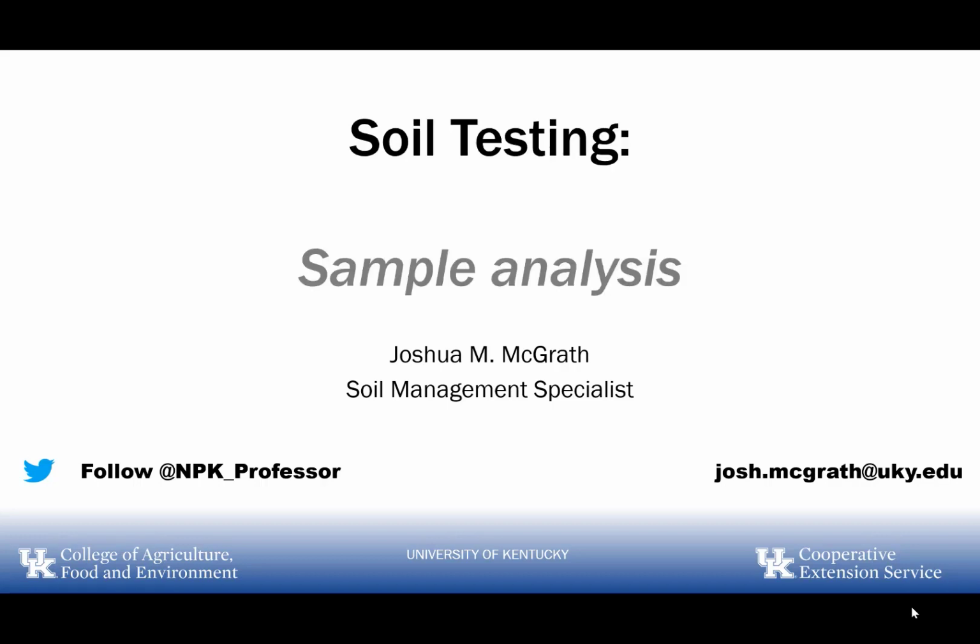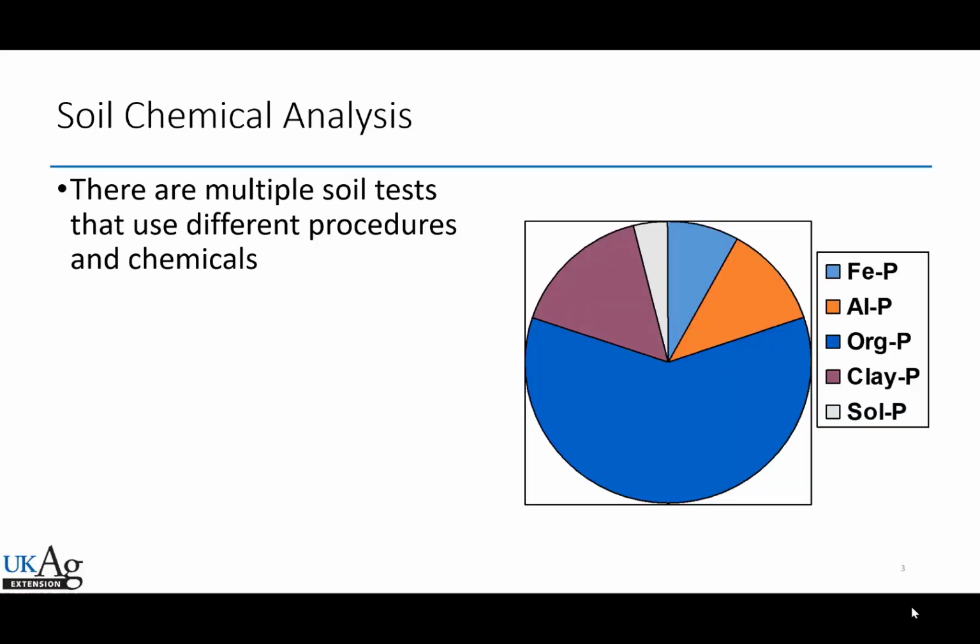In this episode, we're going to be talking about soil testing and specifically analysis of those samples you can collect. So when we take and send off a soil sample for analysis, we've gone out in the field, we've collected it. If you haven't watched that video, go check it out on collecting soil samples.